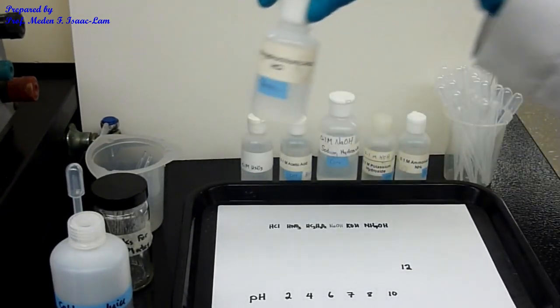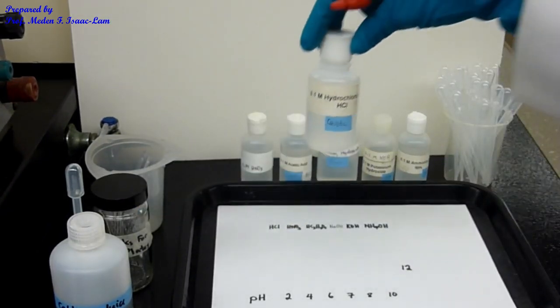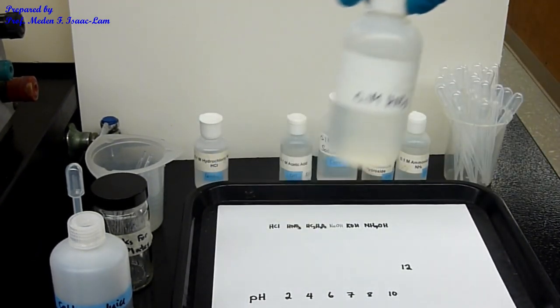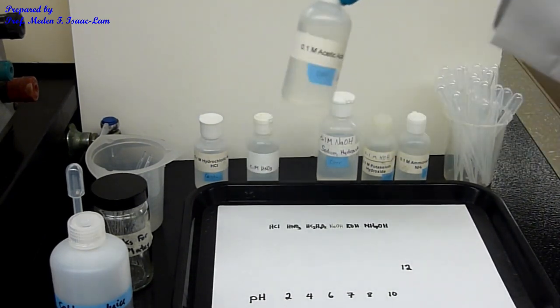Again, this one is hydrochloric acid. They're all 0.1 molar. Then nitric acid, and then acetic acid.